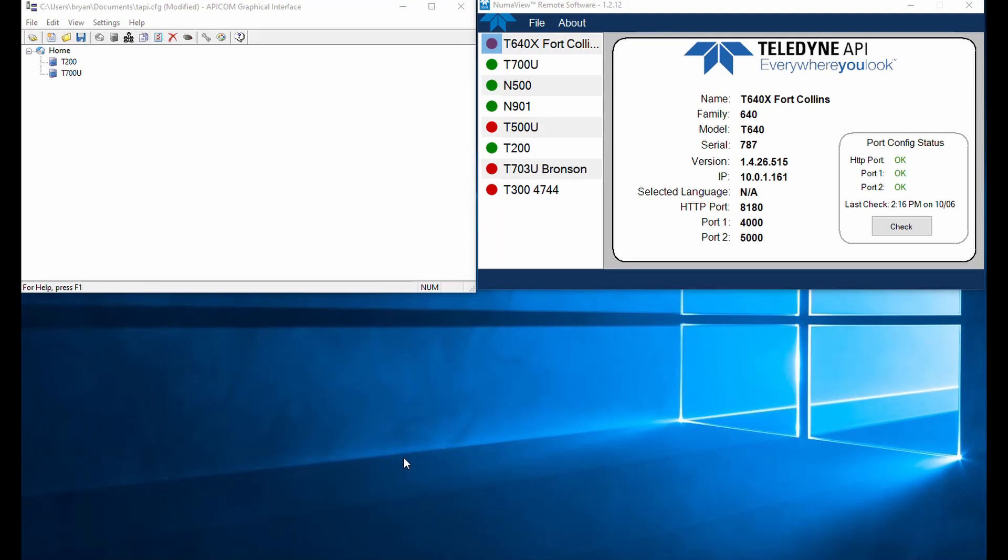All right, Brian here with Teledyne API. I wanted to go over something that a lot of customers ask about that are running our T700, our T700U dilution calibrator with Numaview software. With our Numaview software, we don't really have a direct method for creating and transferring sequences off the calibrator.